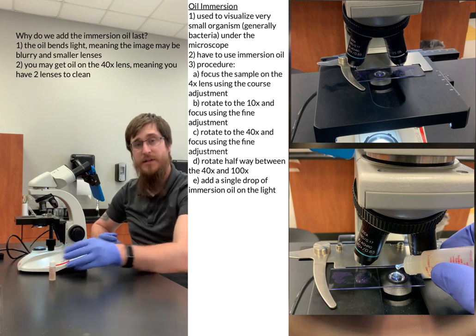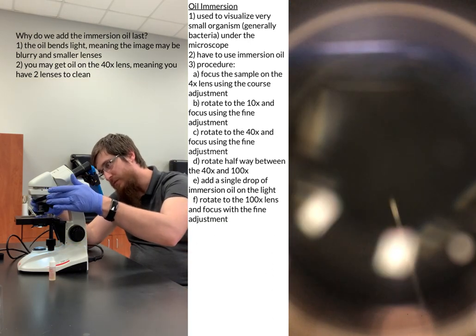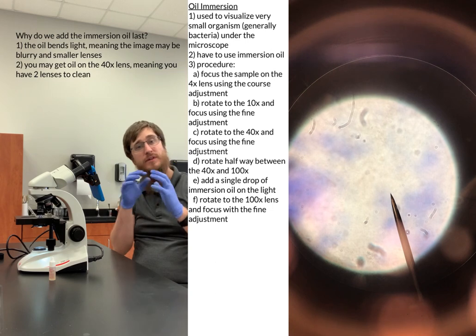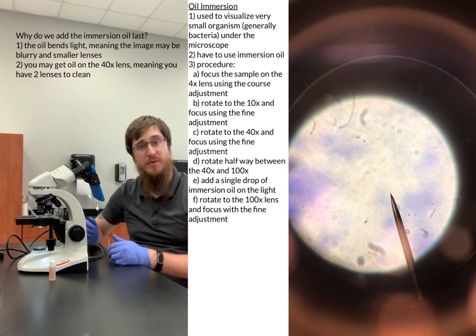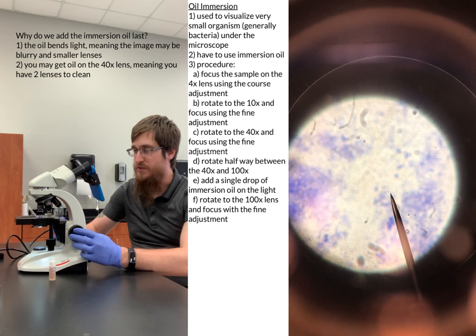Now I can go ahead and I can only move down onto the 100x lens. So I'm going to move the 100x lens down into the oil. And at this point, again, you should see it kind of wrapping up around it if you're looking at it from the outside of the microscope. But now we can go ahead and we can try to visualize our little bacteria and try to see if we can get it into focus.